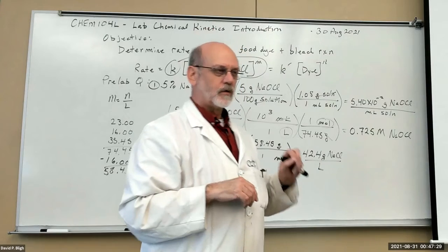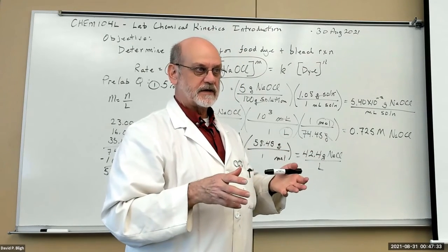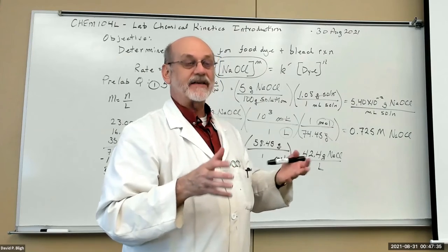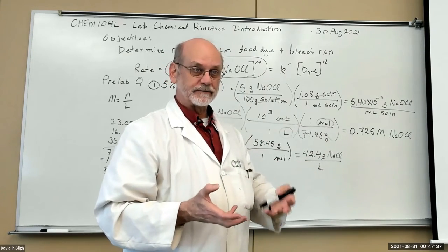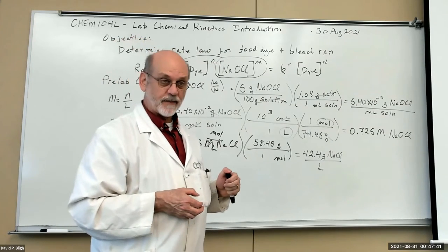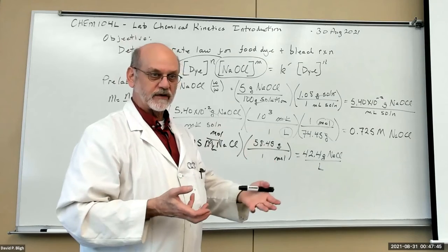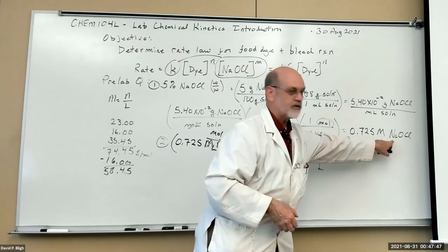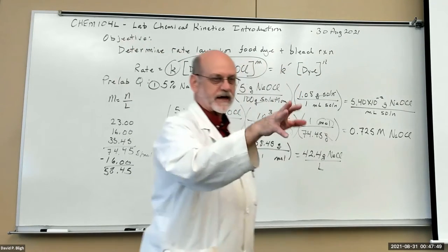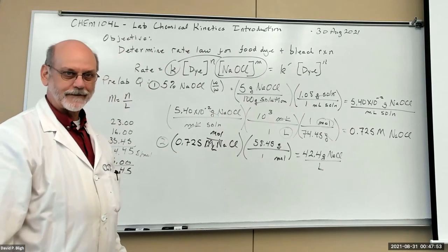And then we're going to weigh the number of drops of bleach to find out what is the mass of drops that you put in. And then based on that and the percent composition of the bleach, we can tell how many moles of sodium hypochlorite we actually put in there. That's what that concentration calculation is all about. Okay.